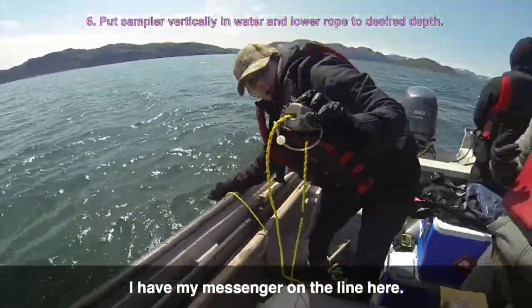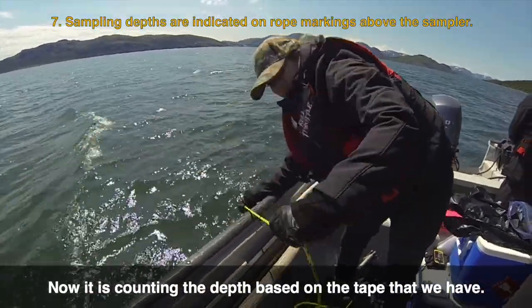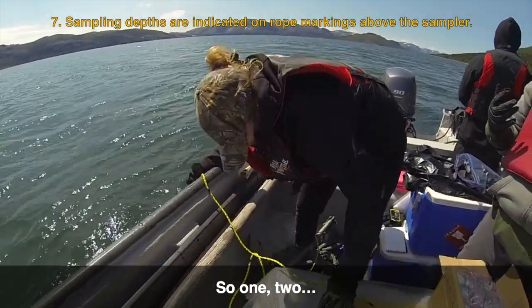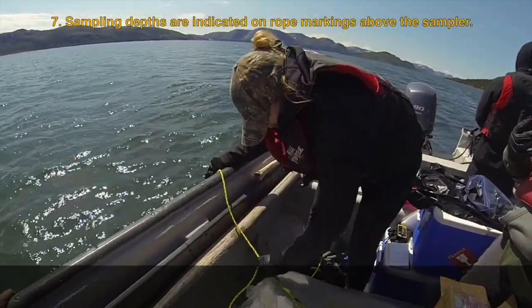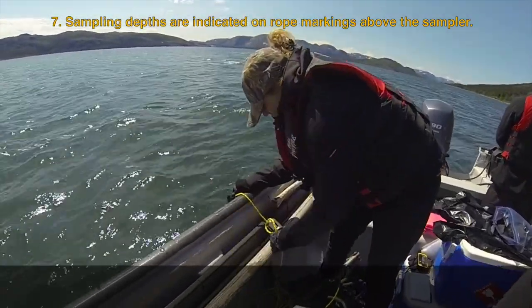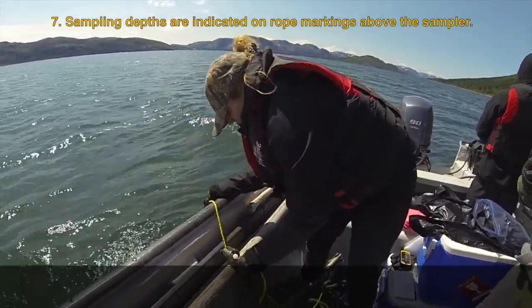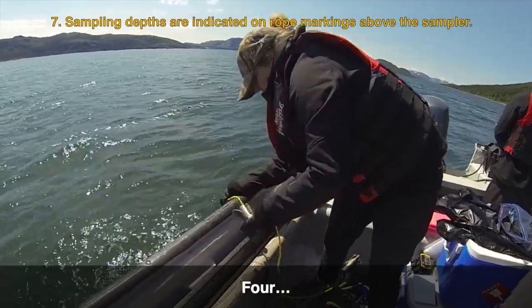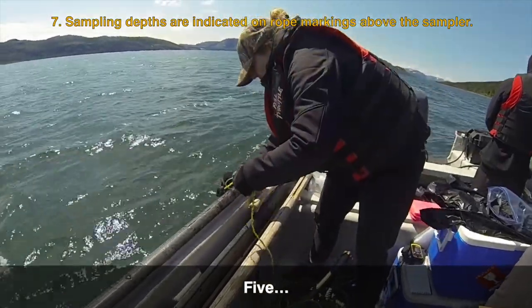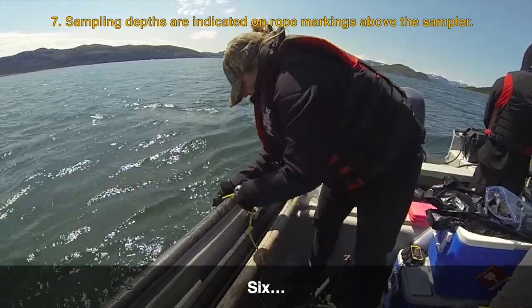Put your weight in first and your Niskin. I have my messenger on the line here. Now I just count the depth based on the tape that we have — one, two, tangle already, three, four, five, six.